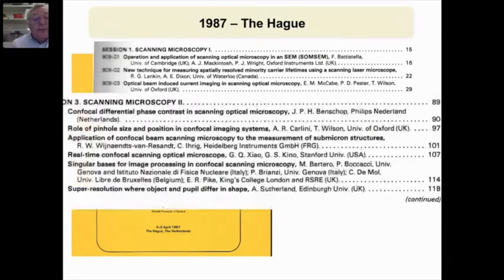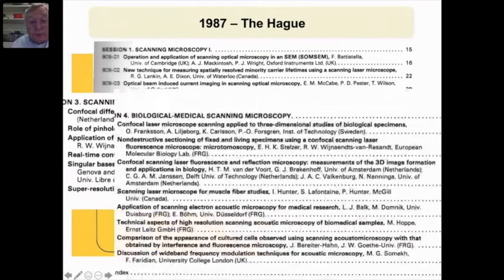Again, there were more things, applying the instrument to the measurement of submicron structures, real-time scanning by Gordon Kino from Stanford. And even as far back as 1987, there was the inevitable lecture on super resolution. There was biology, of course, but it was very much in its infancy.